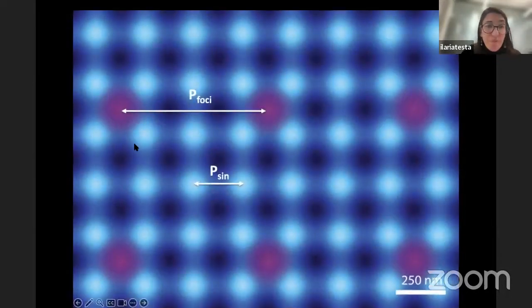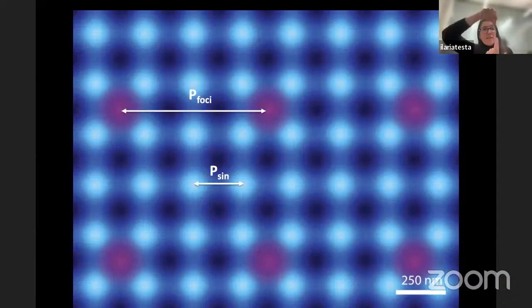Typically we like to decouple the periodicity, so for switching off, instead of the donut, we use a very fine sinusoidal pattern, so that we can confine with very little light. And to read out, we like to still have a little bit higher periodicity so that we minimize lateral, but especially axial crosstalk, so we are better at sectioning.